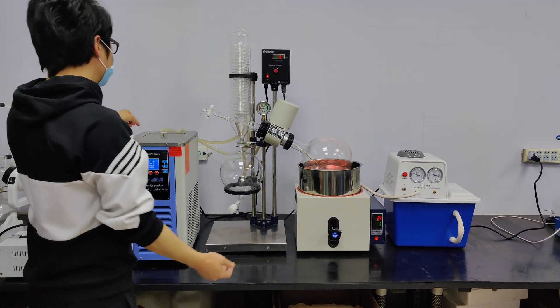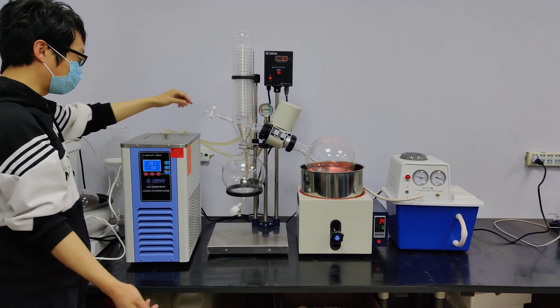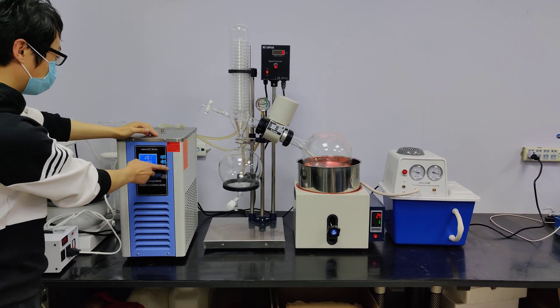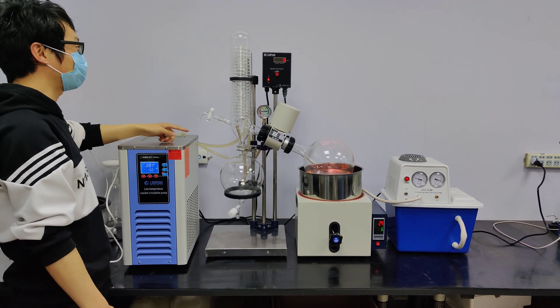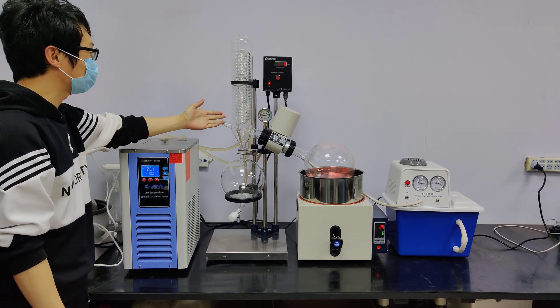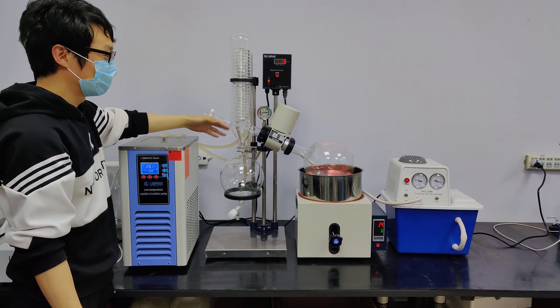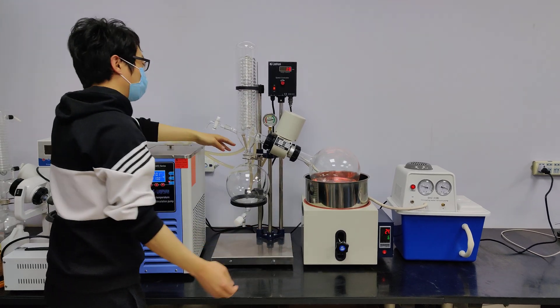See the chiller connected with the container of the rotary evaporator. It can open the circulation — it's not a lot, but you can see the circulation. And the vacuum pump is activated with the vacuum port.